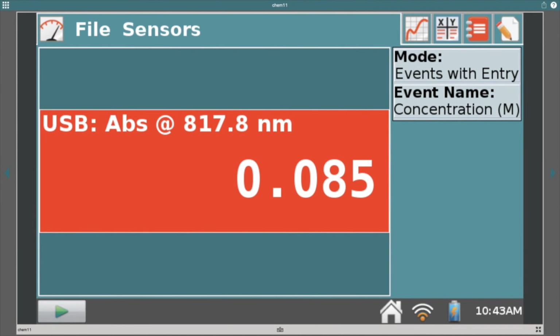You can also plug the absorbance value in for the y in the equation from the linear fit and solve for the concentration.